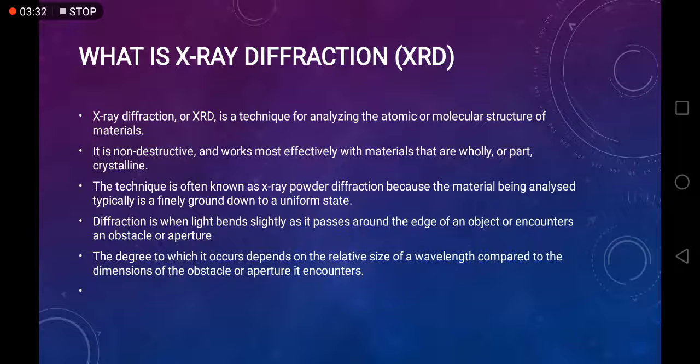All diffraction methods are based on generation of X-rays in an X-ray tube. These X-rays are directed at the sample and the diffracted rays are collected. A key component of all diffraction is the angle between the incident and diffracted rays. Powder and single crystal diffraction vary in instrumentation beyond this.